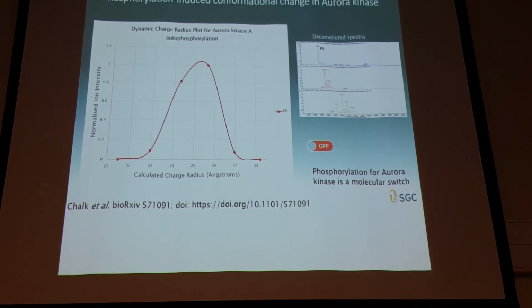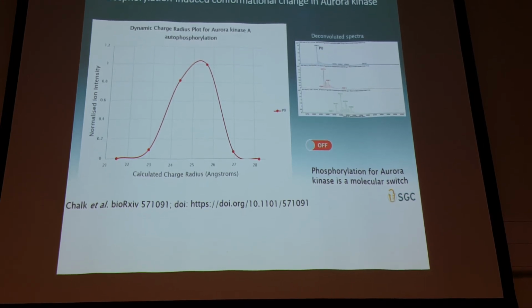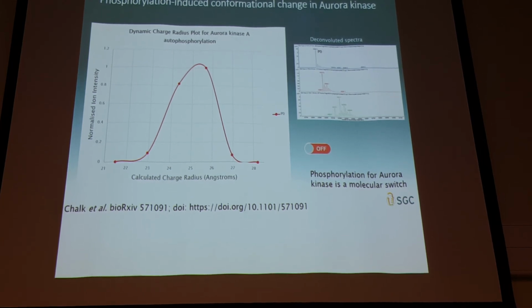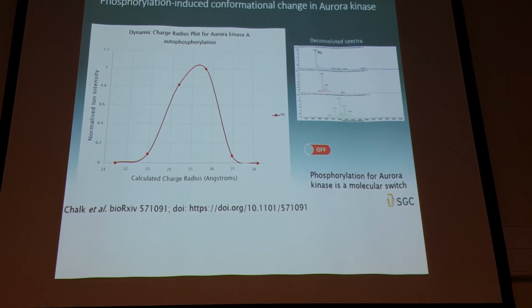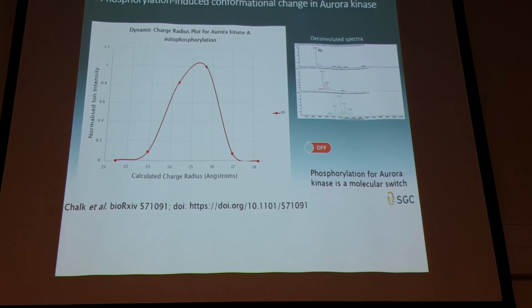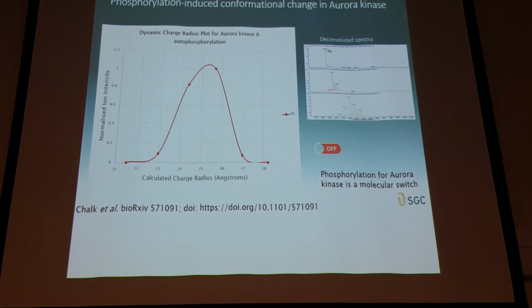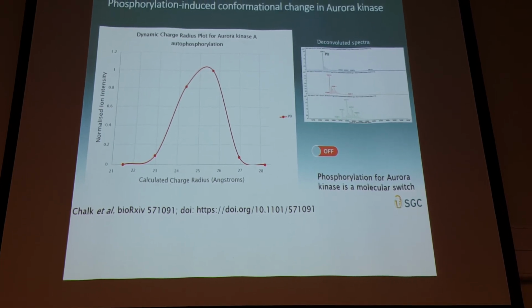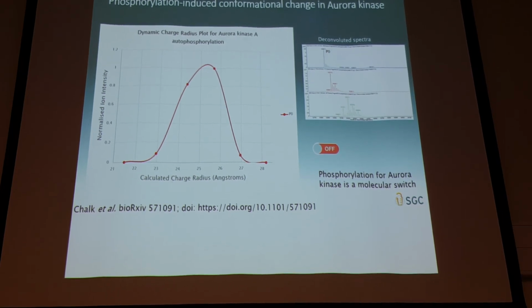This is the theoretical radius of a spherical protein which has the same charge. So it's an inverse to what we usually do. It's one of the problems in interpreting native spectra: usually your x-axis increases from left to right with charge, but because you're plotting MZ, it decreases from left to right, so it's a little bit confusing. But this is plotted this way.